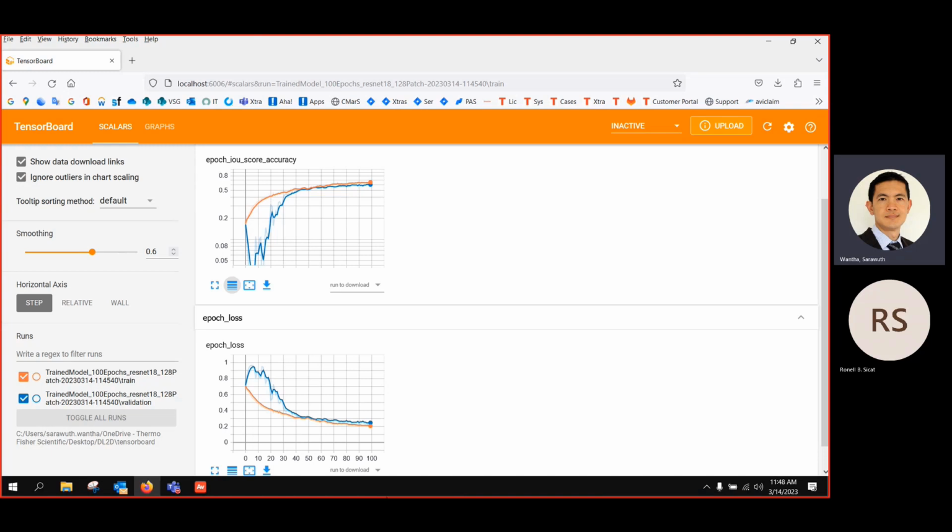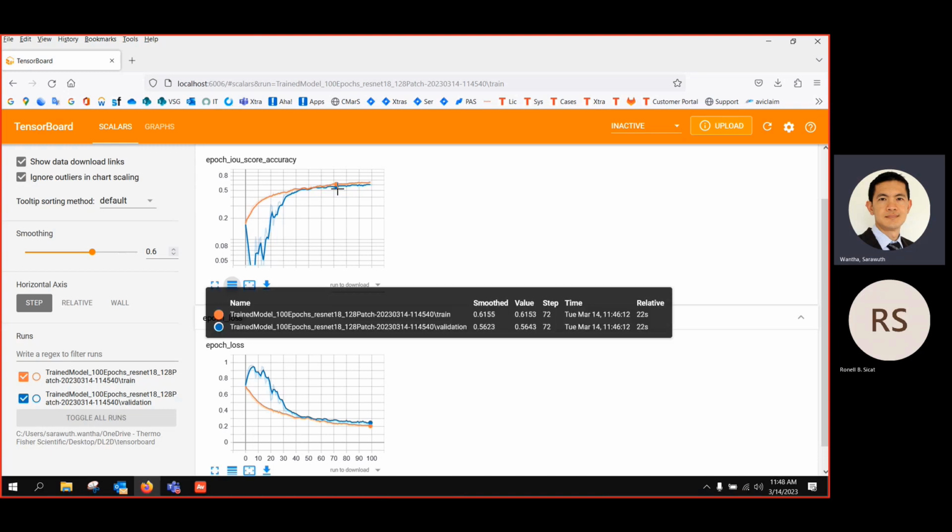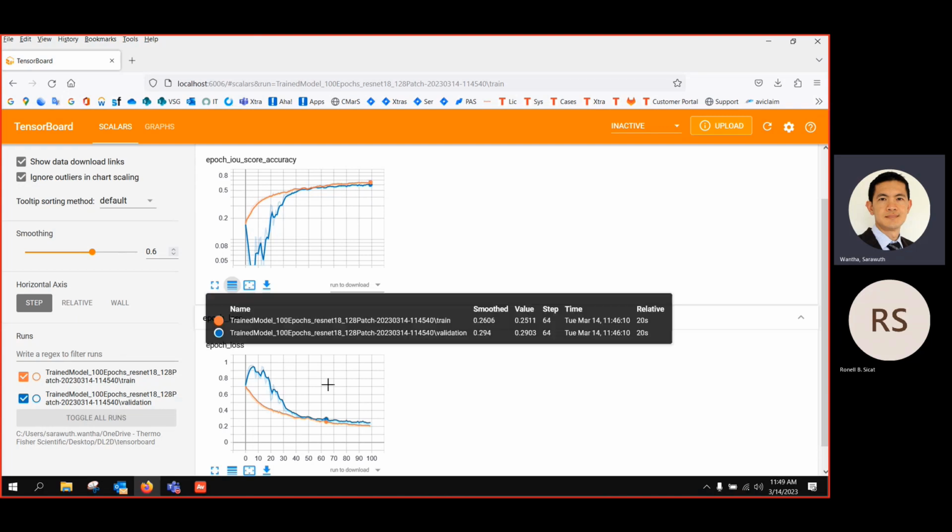That's how they remember everything by heart, and that's called overfitting in terms of the training and the validation. That's why we have to be careful. When you look at the curve, if you have this blue trend of the validation swinging quite a lot, like here, if you have a real swing from the training value, that means it's overfitting, and it just remembers by heart. So it's not going to give you a good indication.